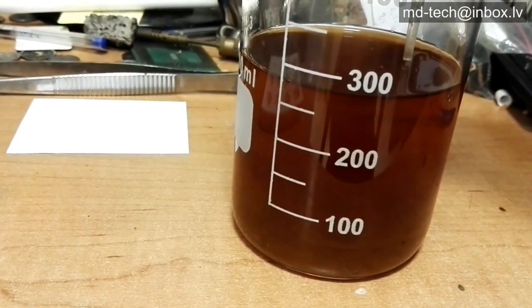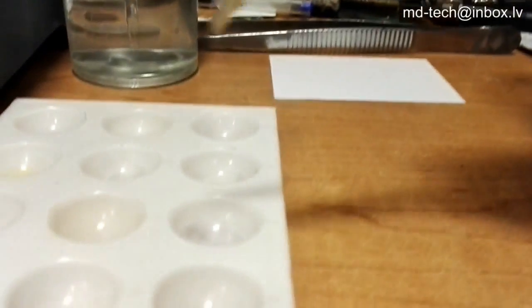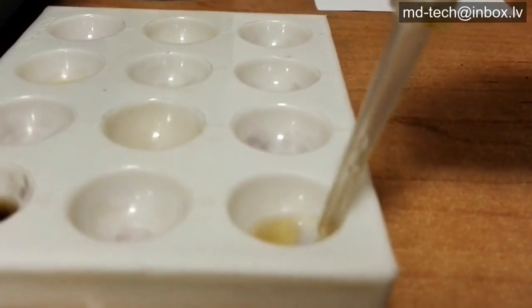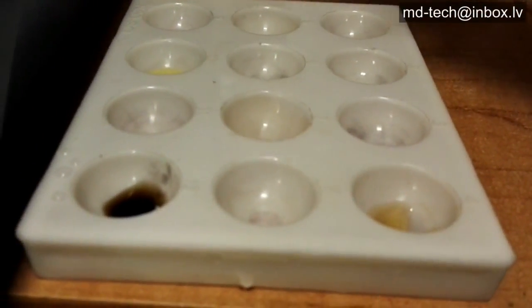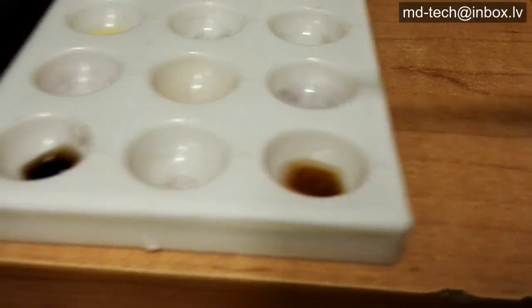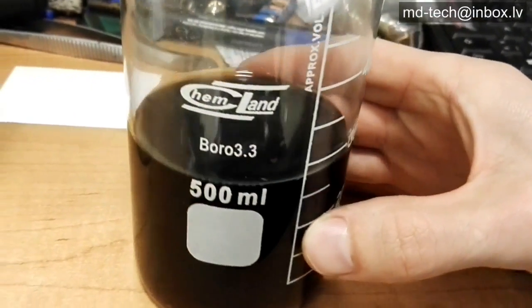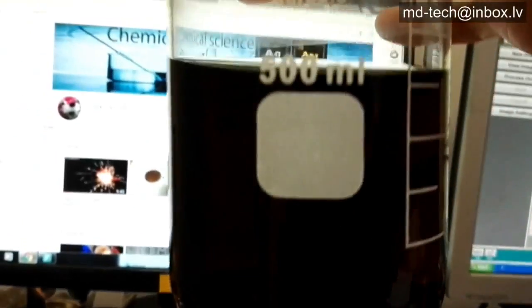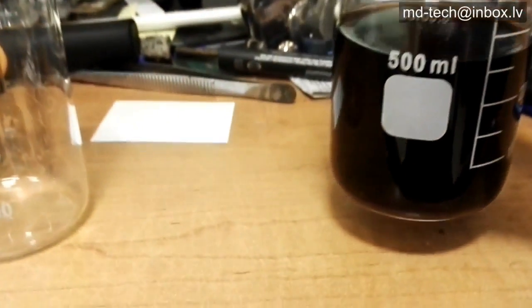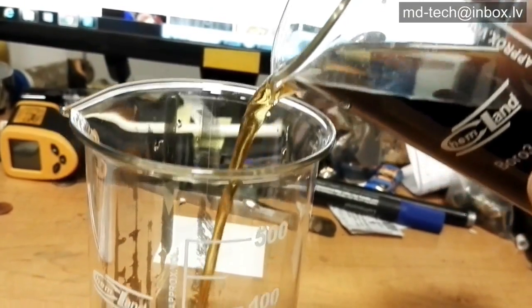Solution after gold precipitation does not change color and needs to be tested for palladium. Palladium is in solution. After the solution is cooled down, it changed color to dark brown. This is palladium sulfate forming.